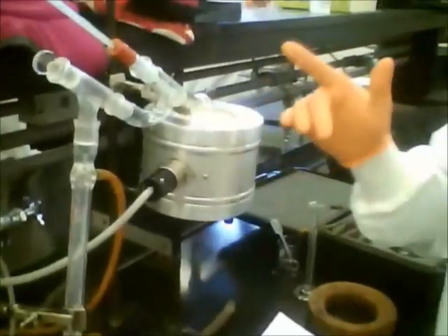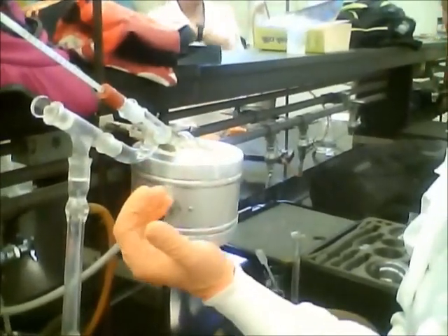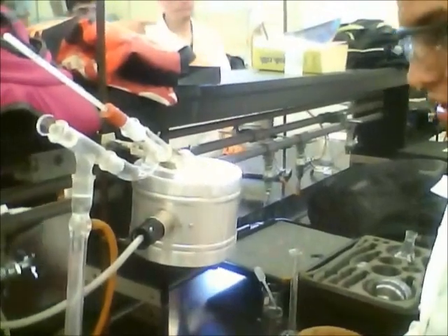The temperature is supposed to be measured right here once it starts. We're going to record the temperature, and that's it.